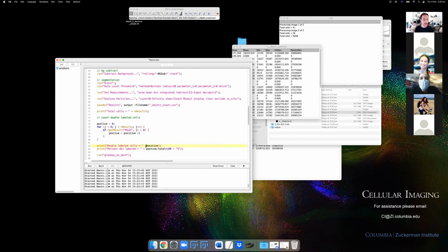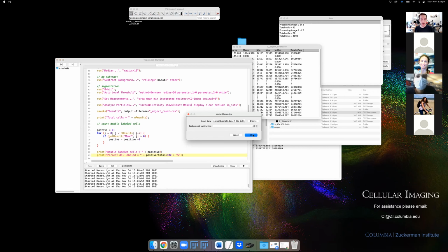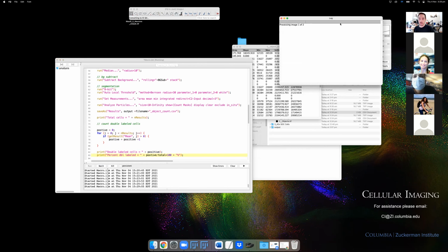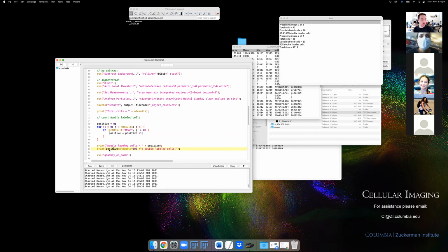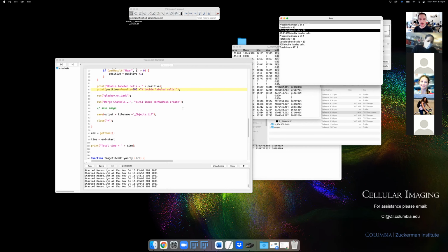You can do a space after the plus or not. It doesn't really matter. It's just for readability. Okay, so hopefully I've done that properly. Let's just run that. There was a typo before. So now we're dividing the number of positives by the total, and then multiplying to get a percent. We can type in here whatever we like. That's a very quick way of getting our result, listed here, but as I said, you could put this into a table. Hopefully that's pretty clear for everyone.